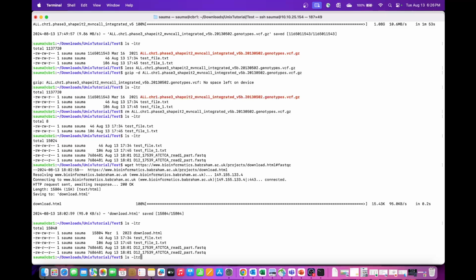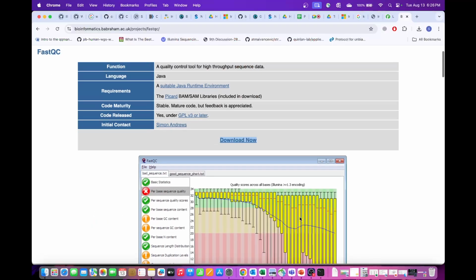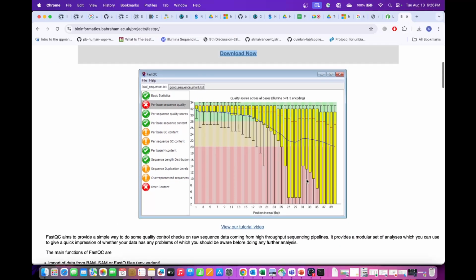Can we use a Conda environment to download the tools? Yeah. So FastQC also, I think, has a Conda environment. So for maximum tools or software that you use, BAMtools, SAMtools, BCFtools, BEDtools, everything, in the GitHub, if you go and check, they'll have an option to get the software from source, which is basically you clone the GitHub repository and you do a make install on that repository and you can install that thing. Or you can use Conda and through Conda you can install it.